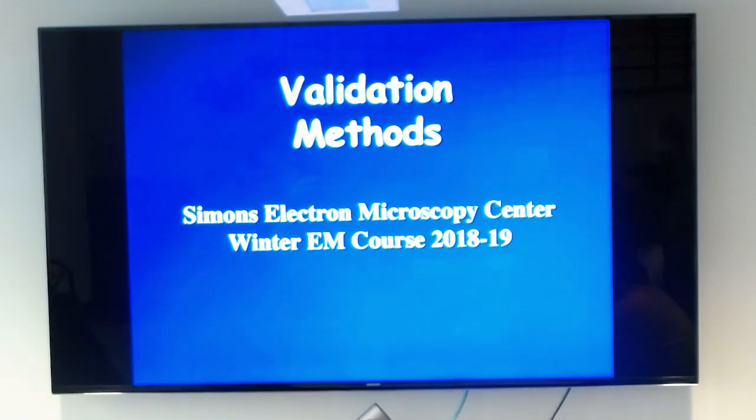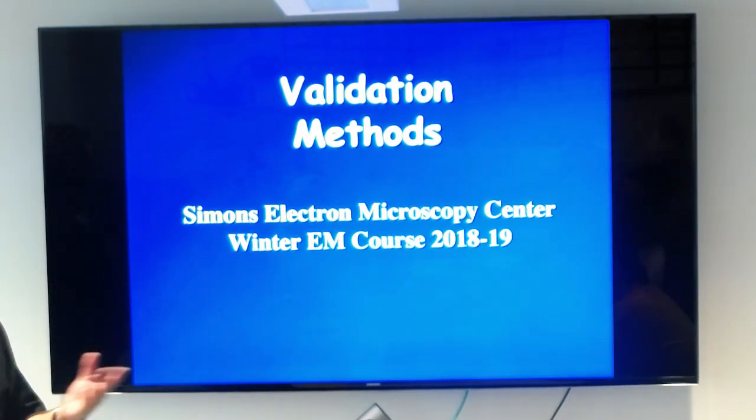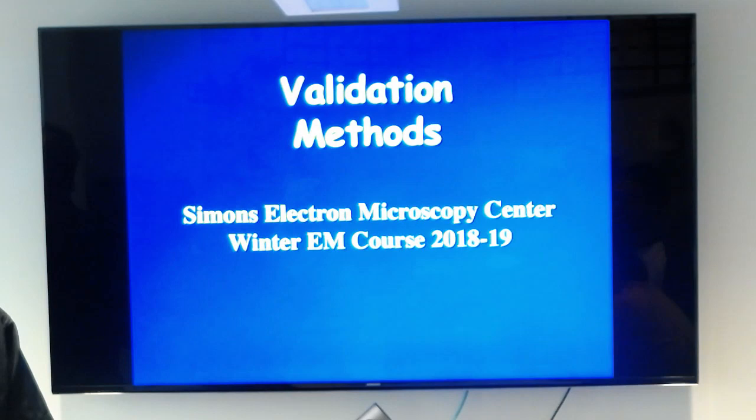I kind of disagree with what Laura just said. Validation used to be really important when we were doing blobs and everybody got some kinds of blobs. Then it was really important to figure out whether the blob you see is correct or wrong. These days you typically get resolutions of at least 10 angstrom, usually better, mostly atomic resolution structures. At that point you can build an atomic model, so validation of the map is kind of what you do as you build the model.